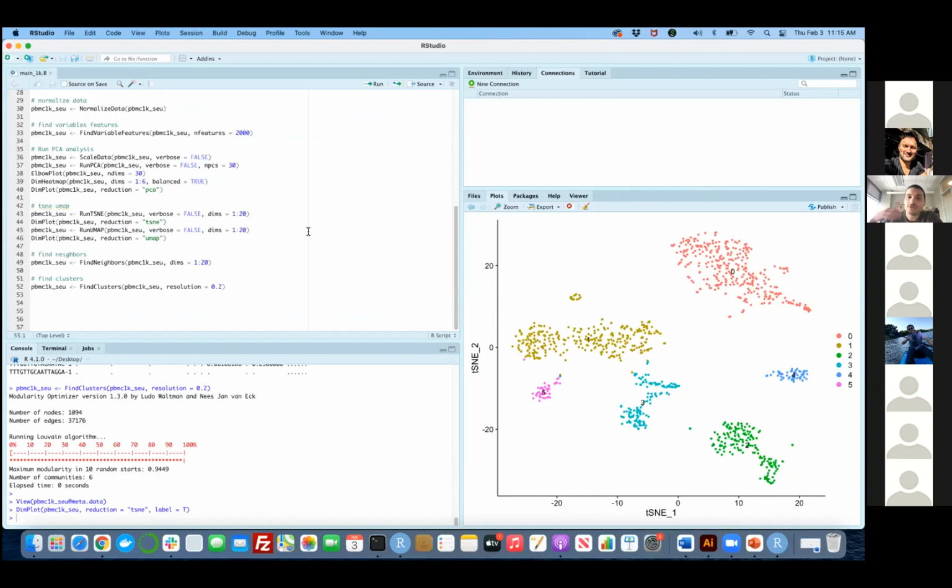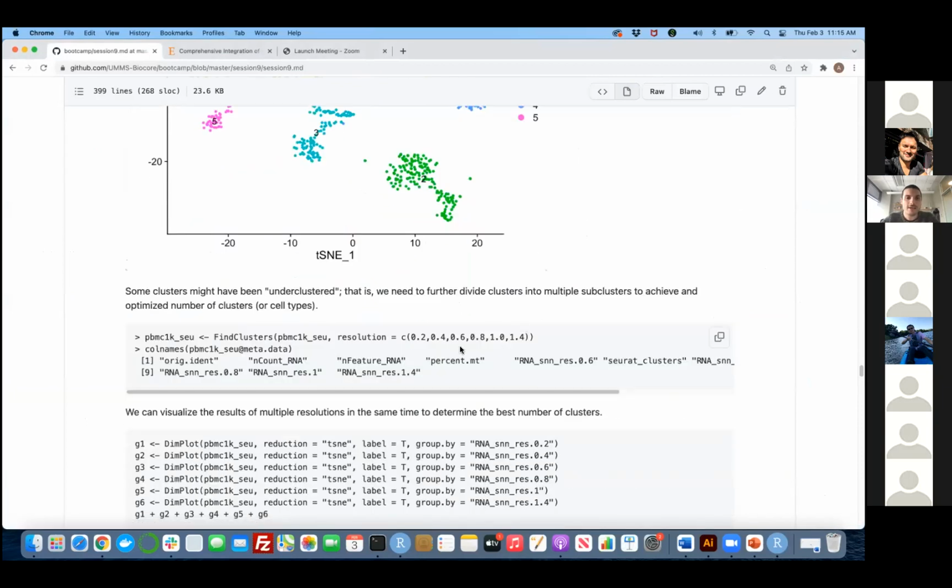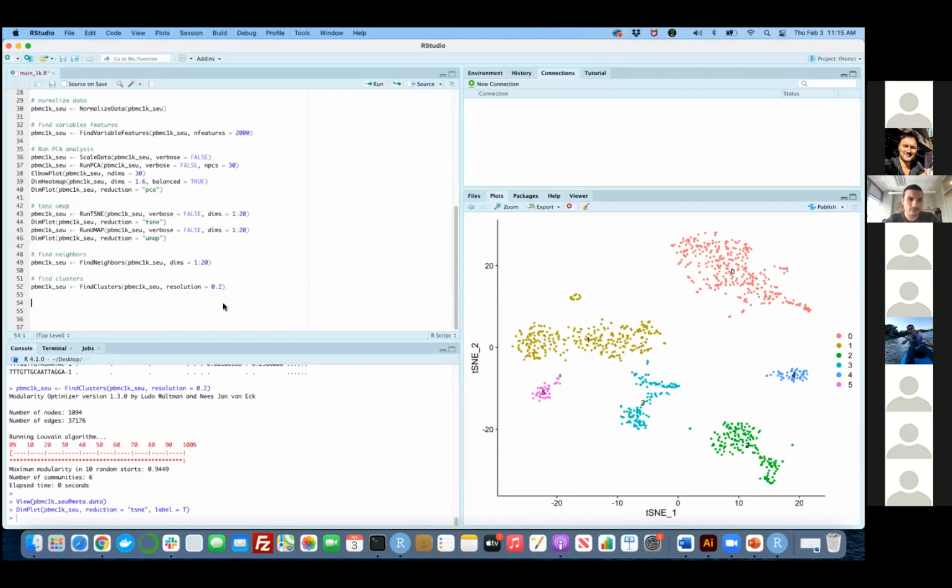So we have to cluster further, right? In order to do that, we're going to increase the resolution parameter. But I actually like to do a different approach, which is the method that I've been referring to when we were talking to Kashi.